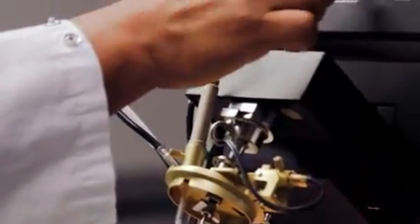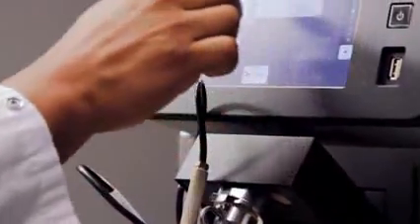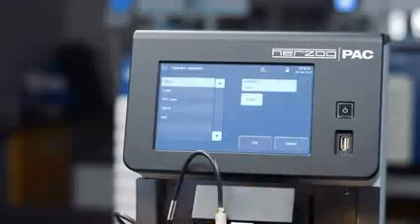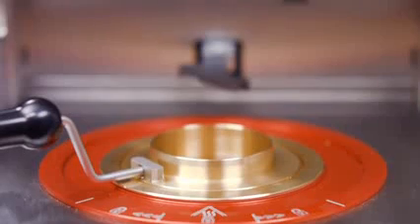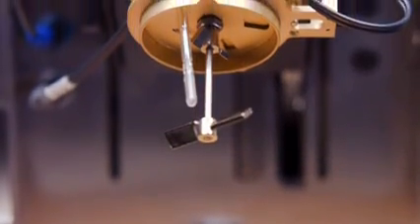Due to its automated operation and intuitive user interface, the OptiFlash is much easier for technicians to use, which significantly reduces operator training. Determining the flashpoint of a product can be a dangerous test to run, just due to its nature.